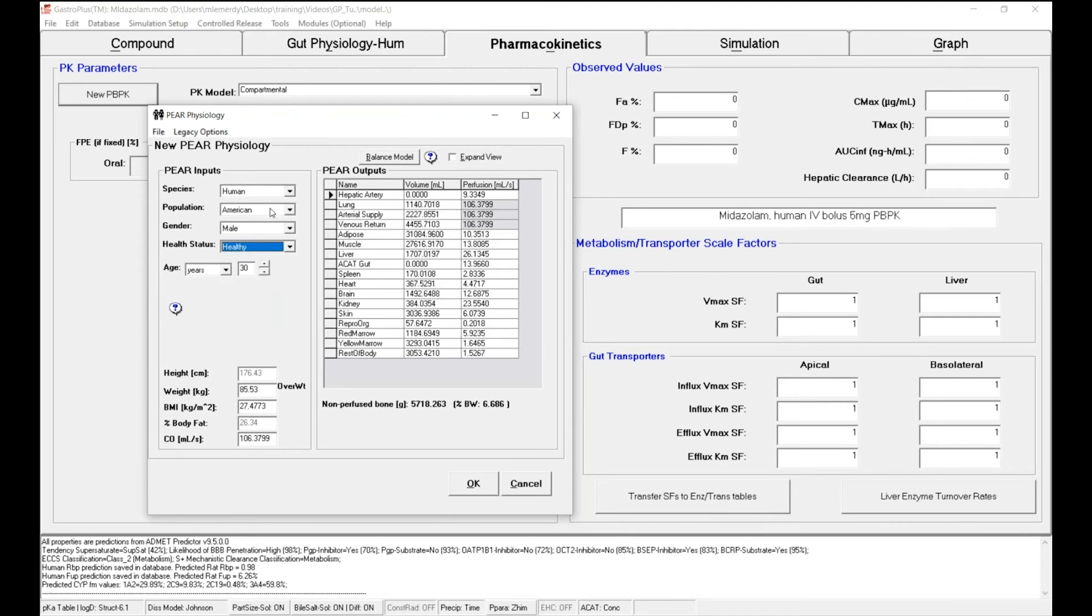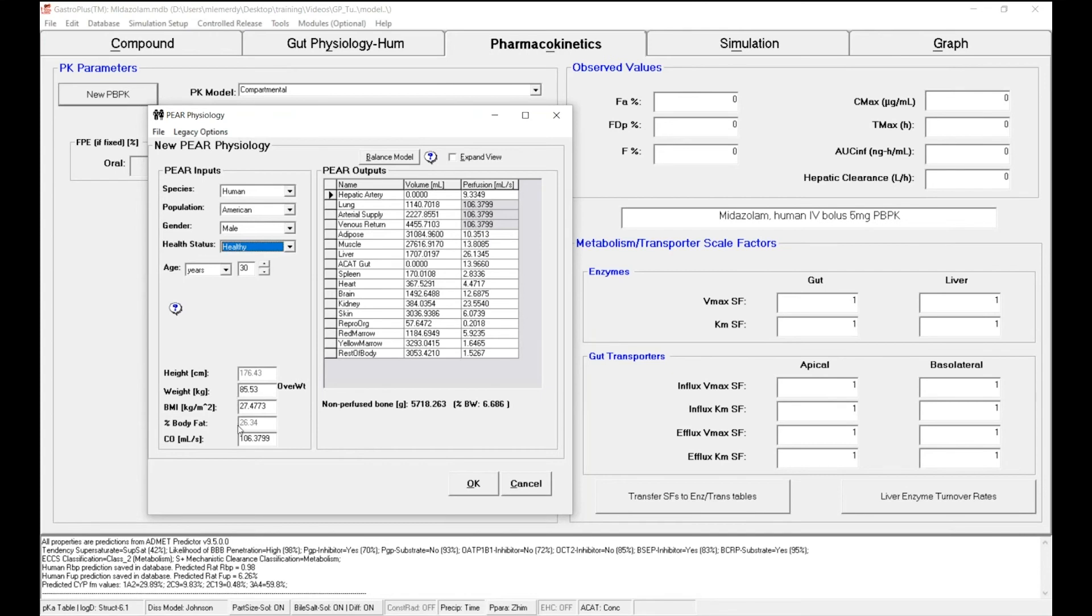Once you have defined your individual characteristics in terms of species, population, gender, and health status, you then need to define the body weight and the age of this individual. In our case, for the IV data, we have information about our subjects to be human American males, healthy. So we use the default settings here.